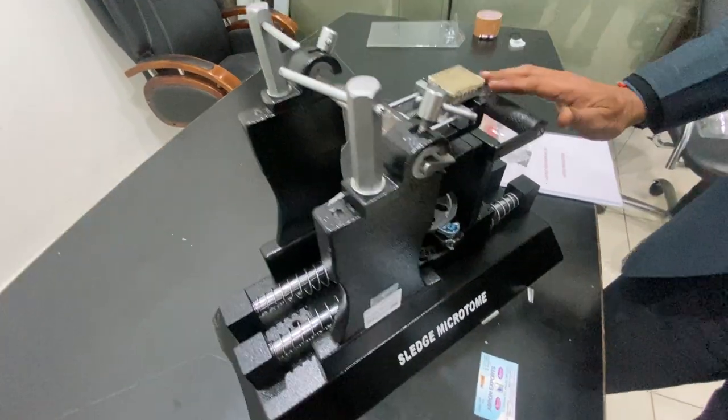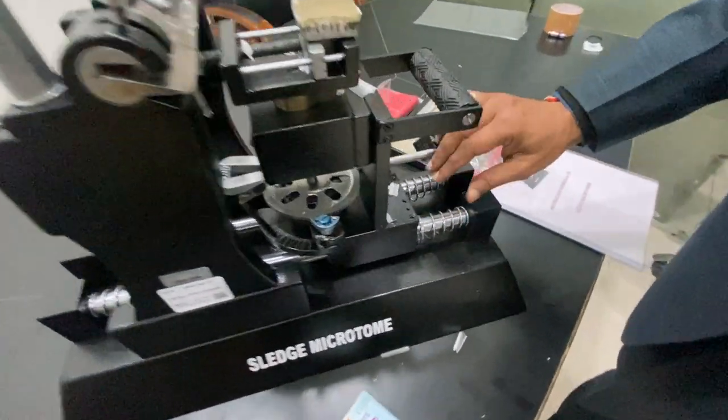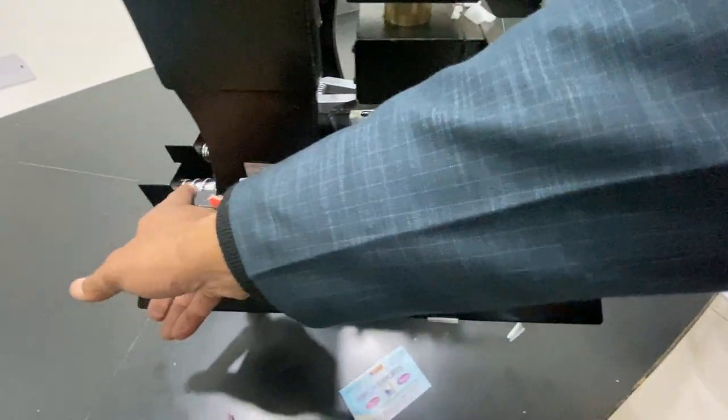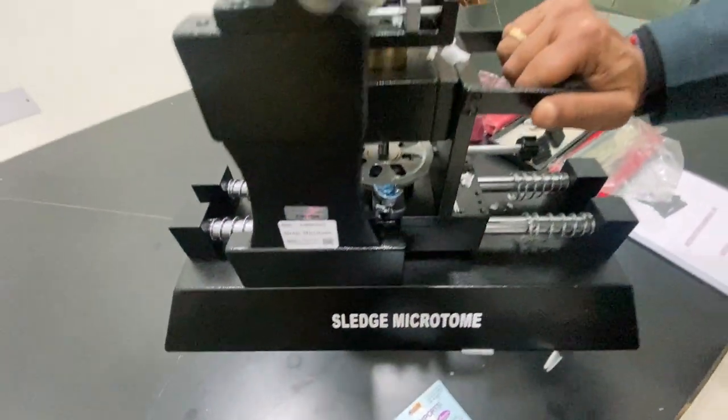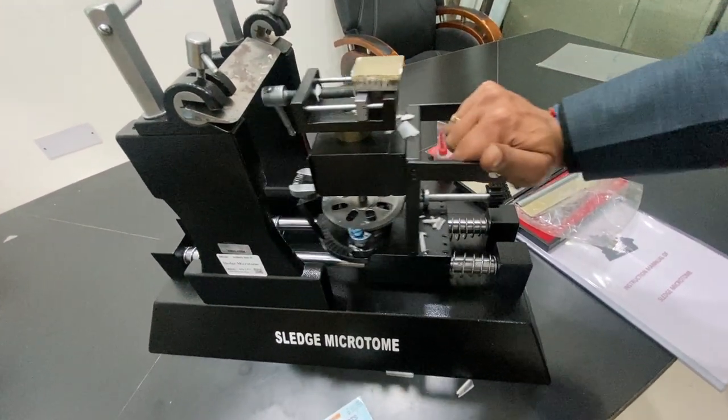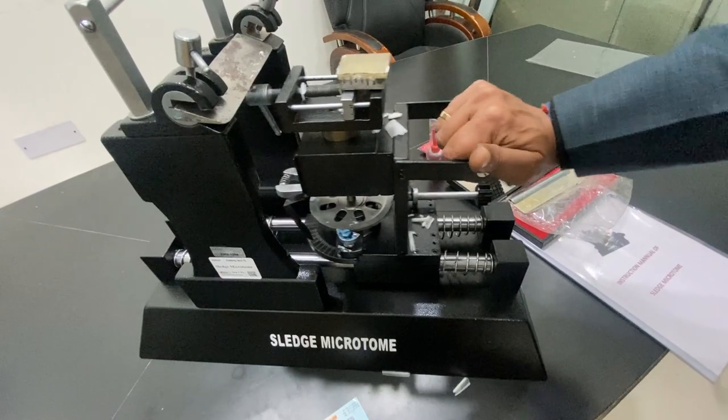Now there are other parts. Let me tell you, this is a rail which has springs on both sides, this side and the other side also, so that when this moves, it does not take a jerk. Automatic springs are stopping it.